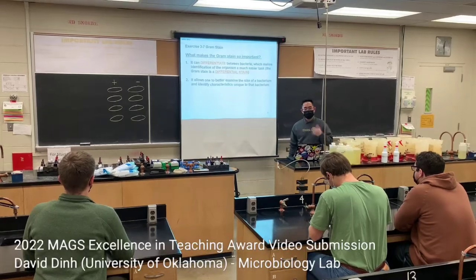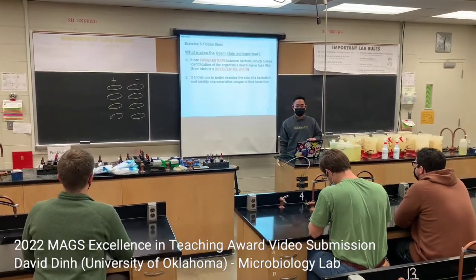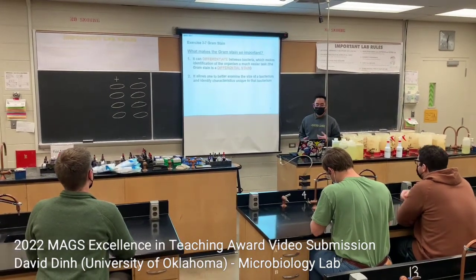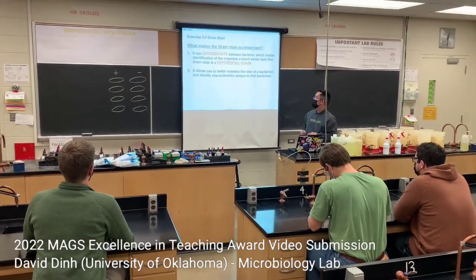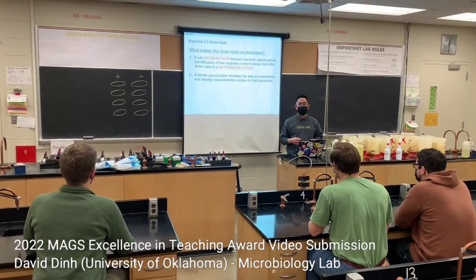But gram staining is important for microbiology because it helps us differentiate between bacteria and it makes identifying organisms a lot easier. So this makes gram stain a differential stain. It allows us to better examine the size of a bacterium and identify characteristics unique to that bacterium.